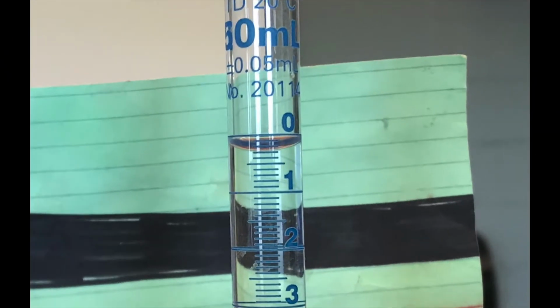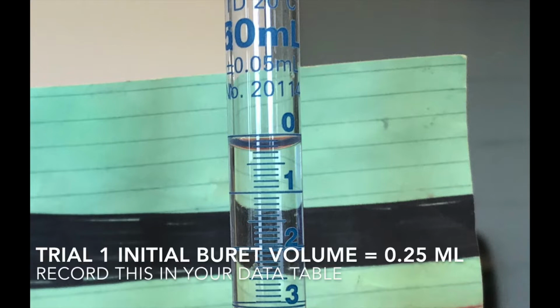So take a look at this picture to get our initial volume, and what you can see is the bottom of the meniscus is sitting between the 0.2 and the 0.3 line. So we have to read to 2 decimal places, so my approximation of that is that it's around 0.25 milliliters. That is the initial burette volume. That is what you need to record in your data table.